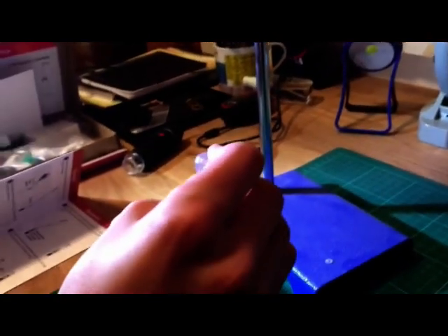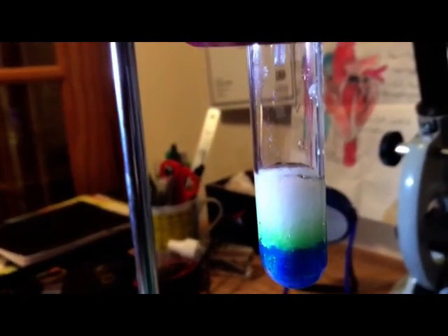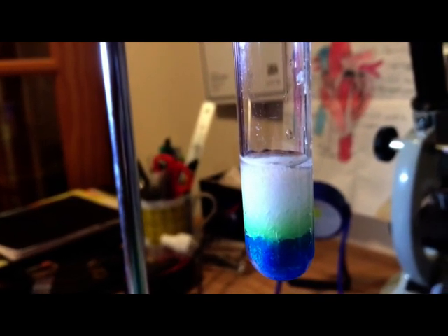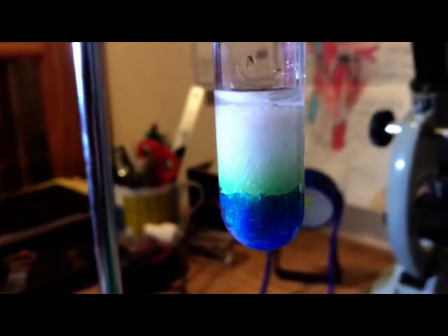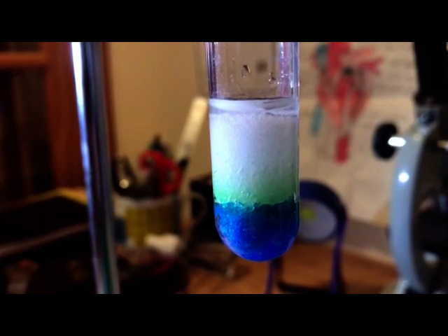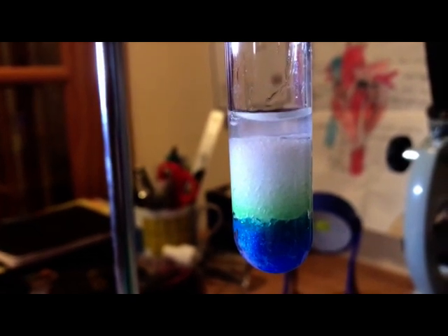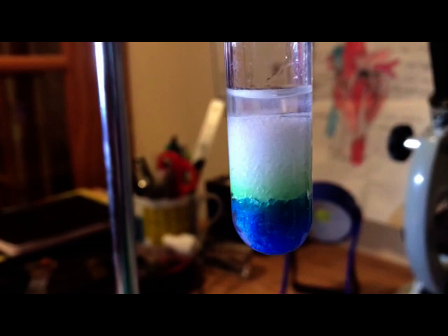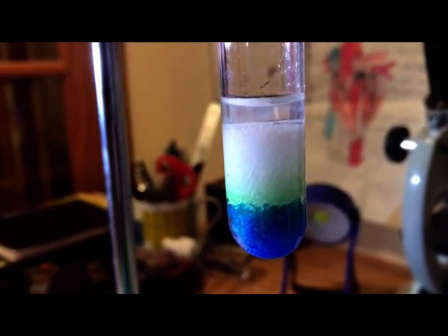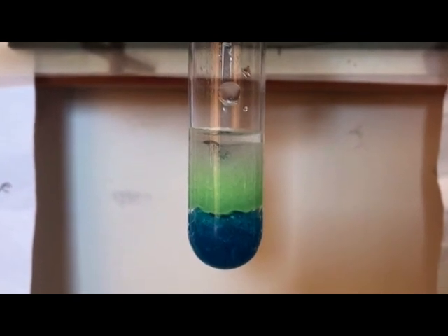We now add water drop by drop to the test tube until it completely submerges the crystals. Let's do it. We can see that some of the copper has gone up the salt layer and we now leave the test tube for a couple of days.